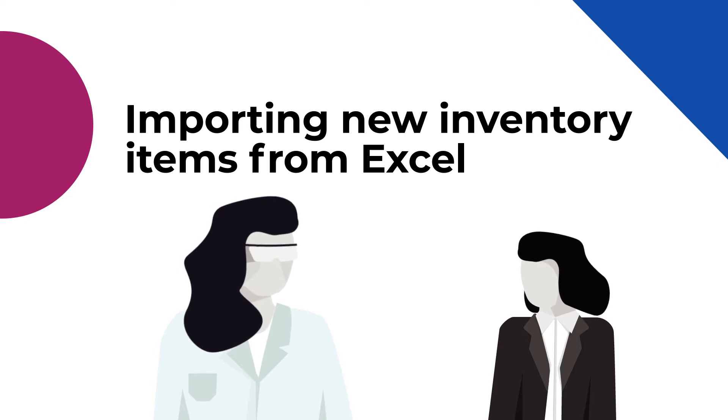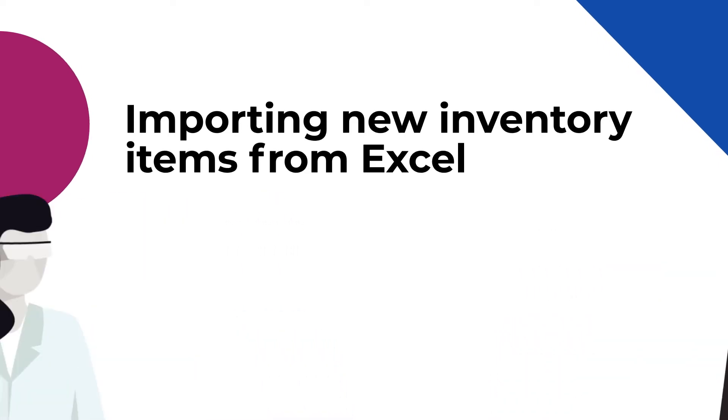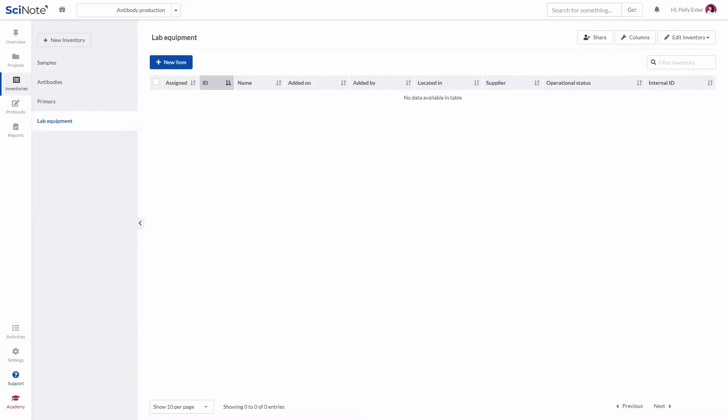I just want to quickly import a list of items I have in Excel to SciNote. You can!